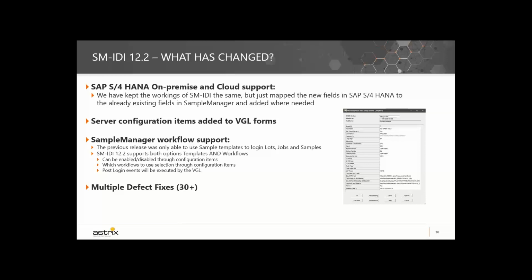Of course, there are a couple of things that were improved, and the most noticeable one is the support for SampleManager workflow. So if you choose to use the new interface, it's still compatible with the old way, which is templates, but this new interface allows you to use workflows as well, which gives you much more flexibility on doing whatever business rule you need to do with your samples after they are logged in, or processed down the road. Okay. And SMIDI 12.2, of course, has a lot of bug fixes in it.